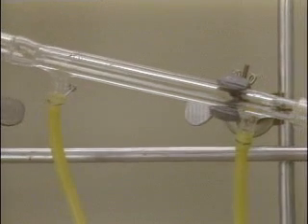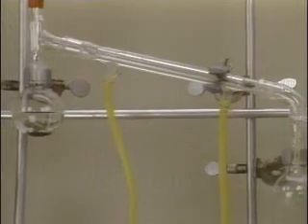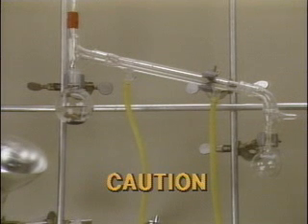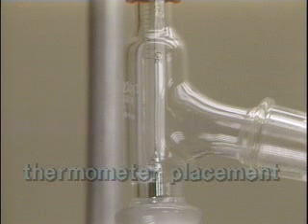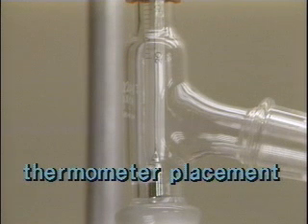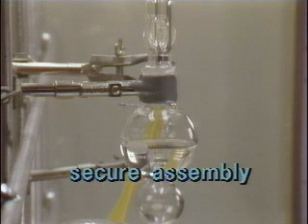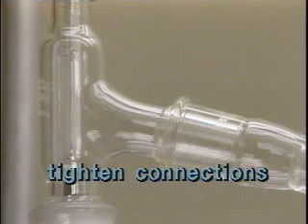After the apparatus is put together, the water flow is slowly started through the condenser. It is always wise to check the assembly carefully before beginning the distillation. Check that the top of the thermometer bulb is properly placed in the distillation head, the assembly is clamped and supported and properly aligned in a vertical plane, and none of the connections have been opened during the tightening process.